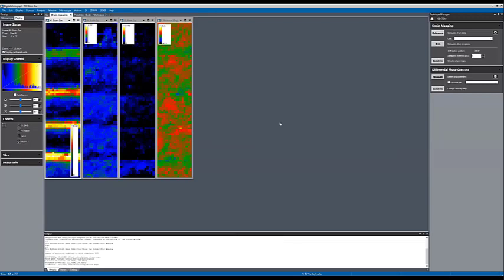So I have people who actually make samples with different thicknesses, and they take it to the microscope and they measure their strain, and they decide based on the results what kind of thickness works best for their type of analysis.